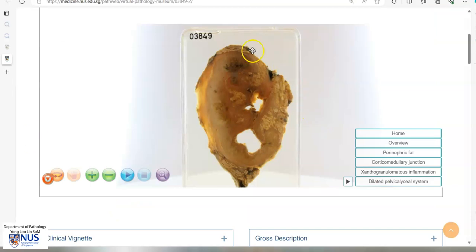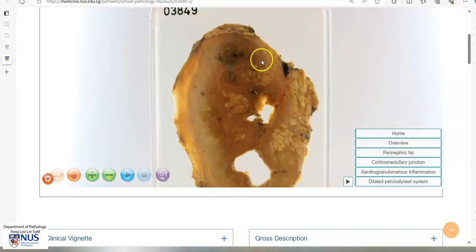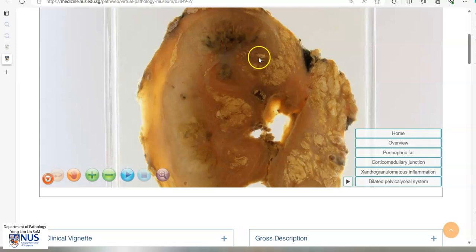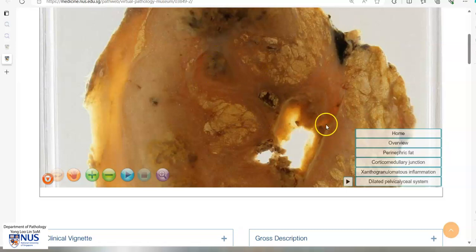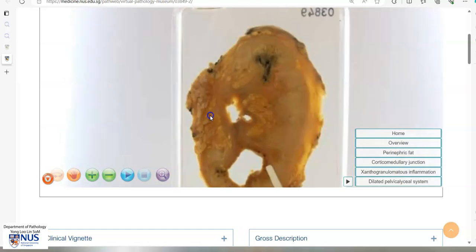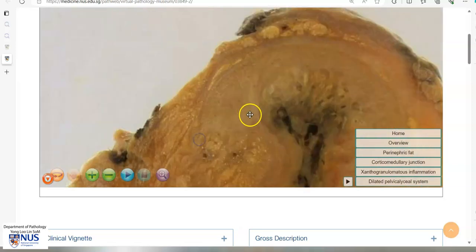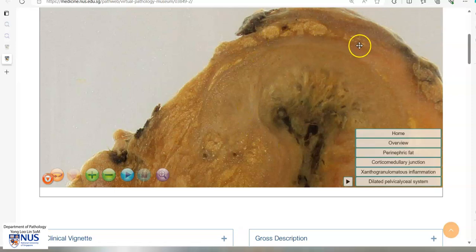In summary, this is an example of xanthogranulomatous pyelonephritis, evidenced by mass-like areas of yellow to orange discoloration which is due to the accumulation of lipid-laden macrophages. There may be accompanying necrosis as well as dilatation of the pelvicalyceal system, and also fibrosis, which is seen better on this surface — we can appreciate these paler whitish areas of fibrosis which can extend beyond the renal capsule into the perinephric fat.